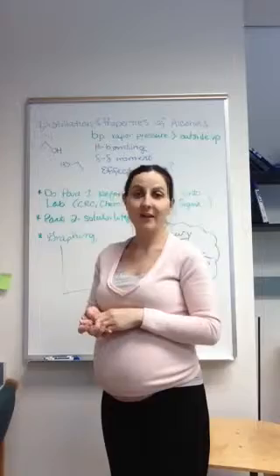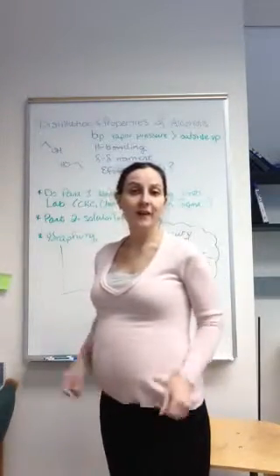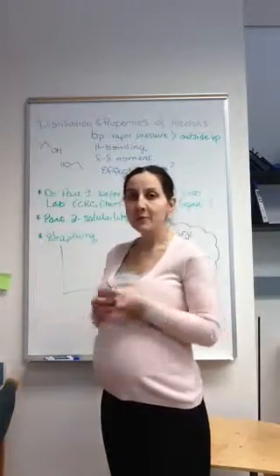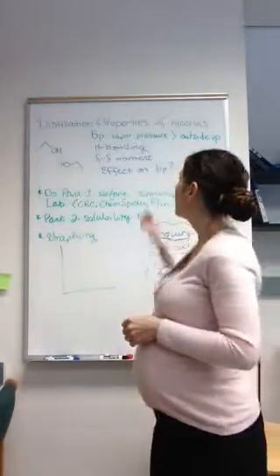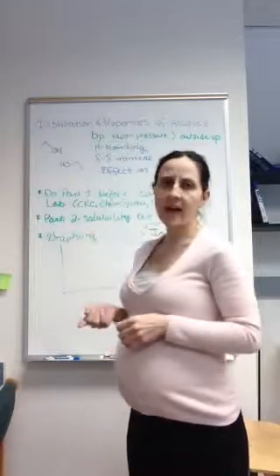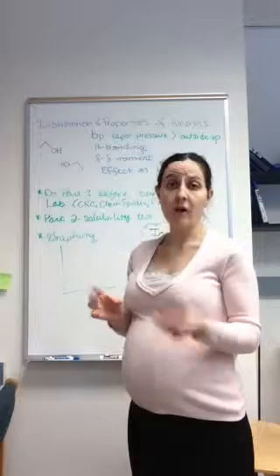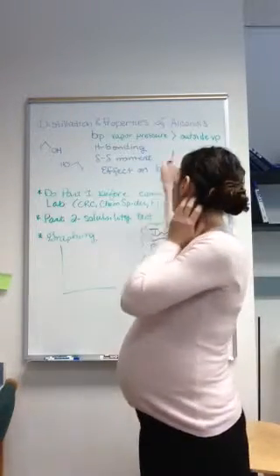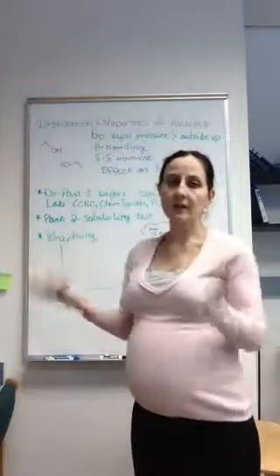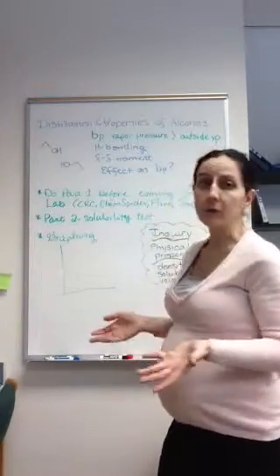This is going to be the theoretical portion of our distillation and properties of alcohol lab. Just to recap from Gen Chem, we define a boiling point as the point at which the vapor pressure of our substance becomes equal to, and then greater than, as we keep heating it, the outside pressure in the room.